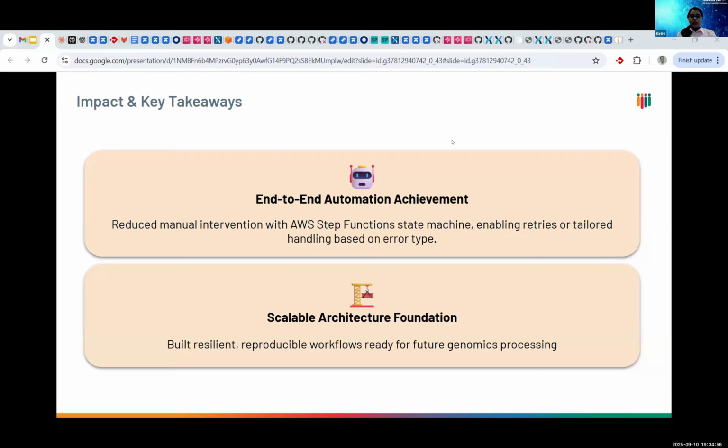Apart from this cost and speed reduction, there are other major important benefits also. One is that we now have a scalable and reproducible architecture. And this is not just a one-off solution. This system can grow with new features coming up. For example, the symlinking that I have mentioned is actually a recent feature put up by DNAnexus, and that can be integrated into the present state machines.